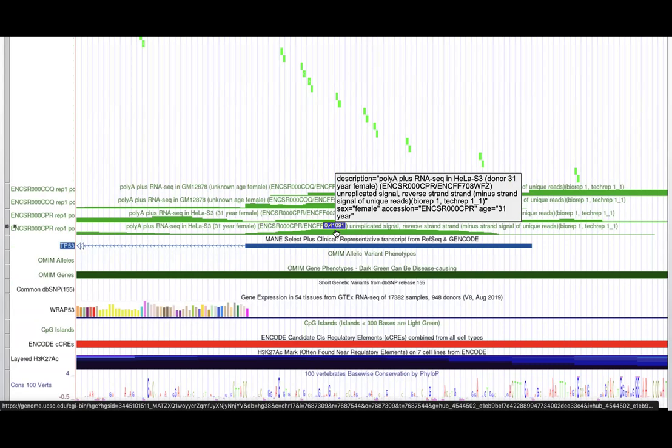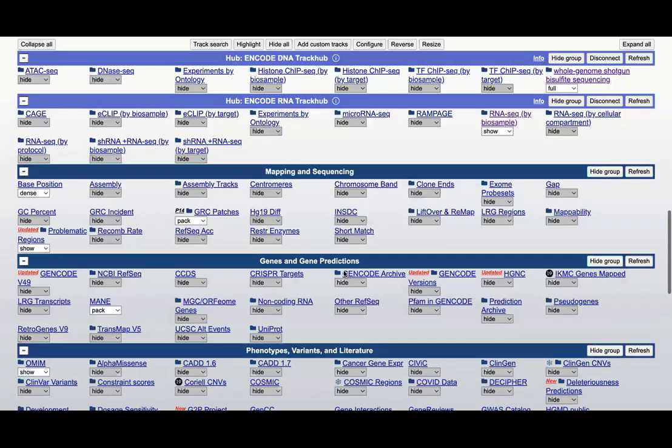And there are some optional steps that you can do to just kind of confirm the relationship between methylation and expression. But I find that adding extra tracks helps to further the evidence to support the big picture question here. Under the regulation track, I'm gonna find that.